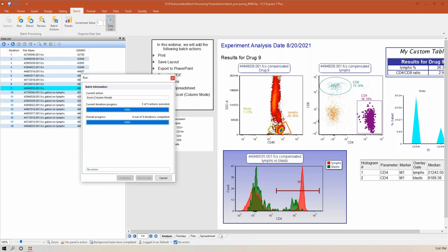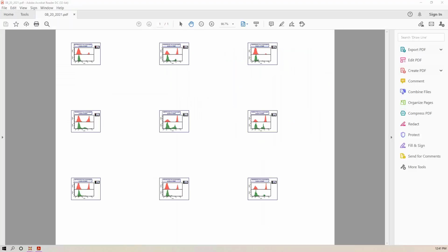Now I selected to open these windows and they're opening. They just open on weird pages. Sometimes they take you by surprise here. So here is my first PDF here, and this is the tiled layout.